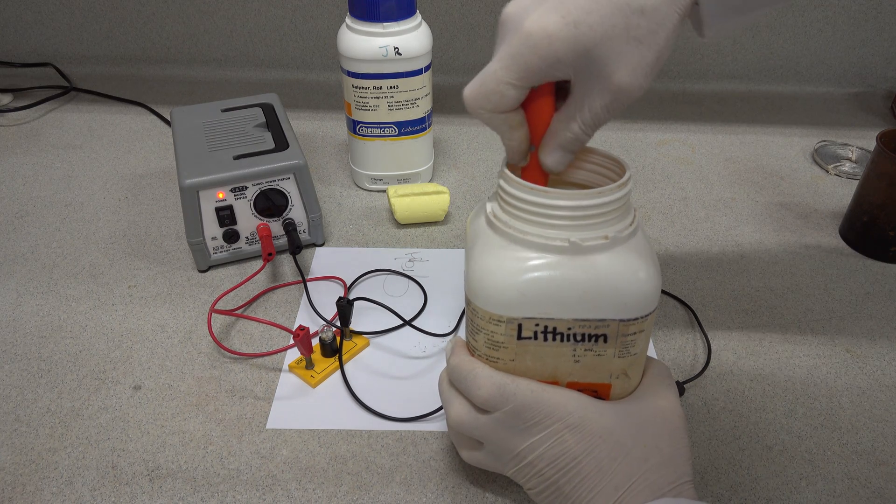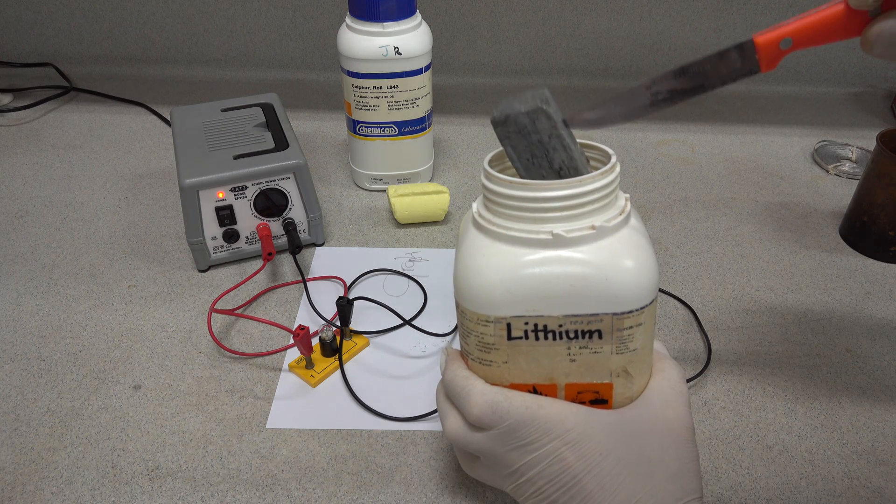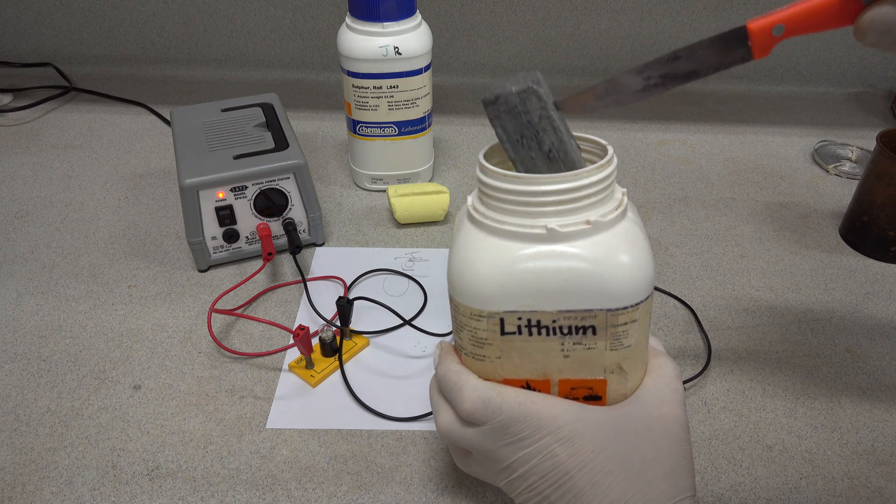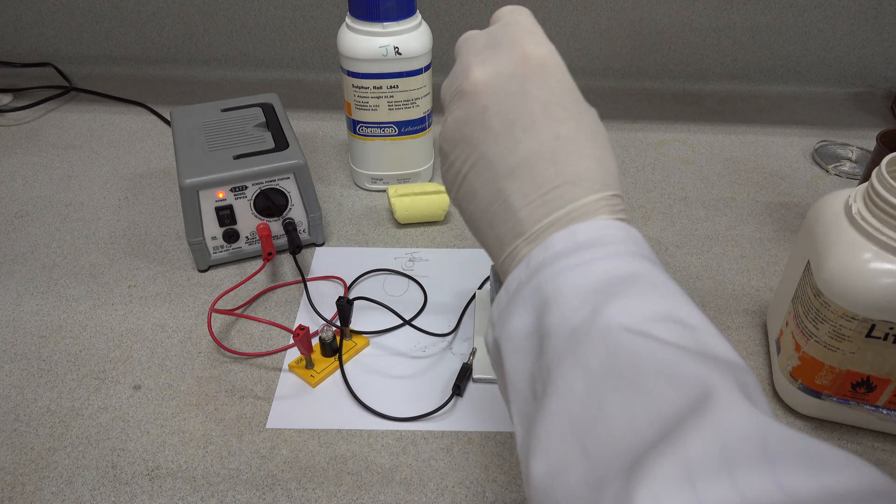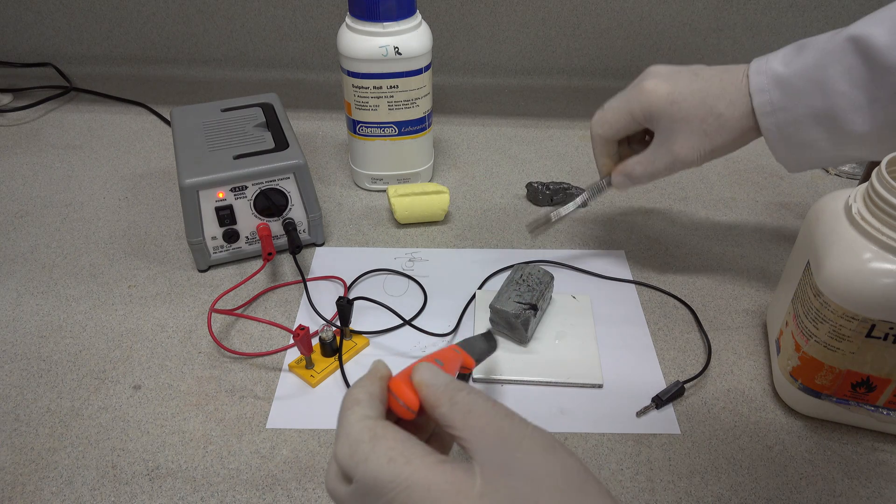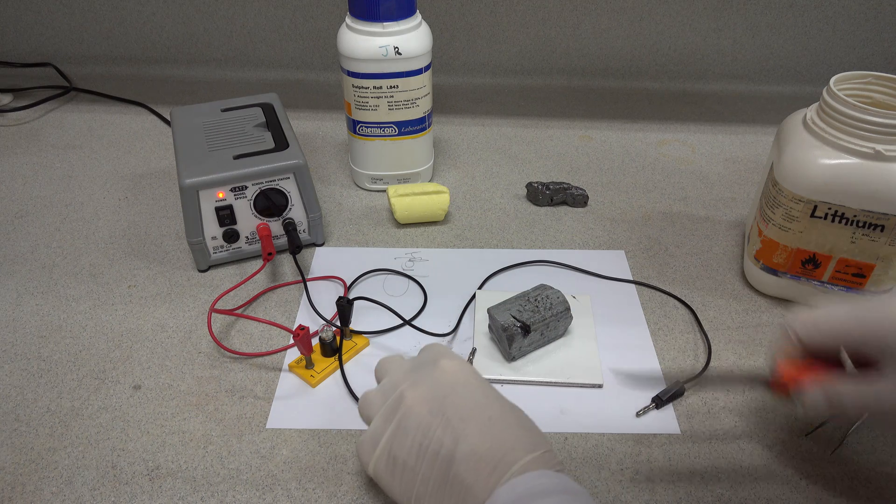It's rather soft, so I can put the knife into it here rather easily. Just letting the excess oil drain off. Onto the white tile goes the lithium. Just need my tweezers to manipulate it a little bit. You can see we've already cut a slice off here.